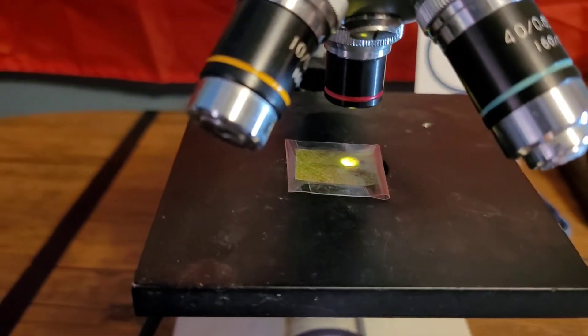I know this one's got a bunch of weird colors on it, so this one should look cool under the microscope. And sure enough, it does look pretty cool. You can see there's a lot of debris on this leaf, and even some rot. Staring at the rot over here in the corner. You can see little insects. This leaf is just crazy. Oh those are seeds. Yeah, this leaf is pretty beat up.